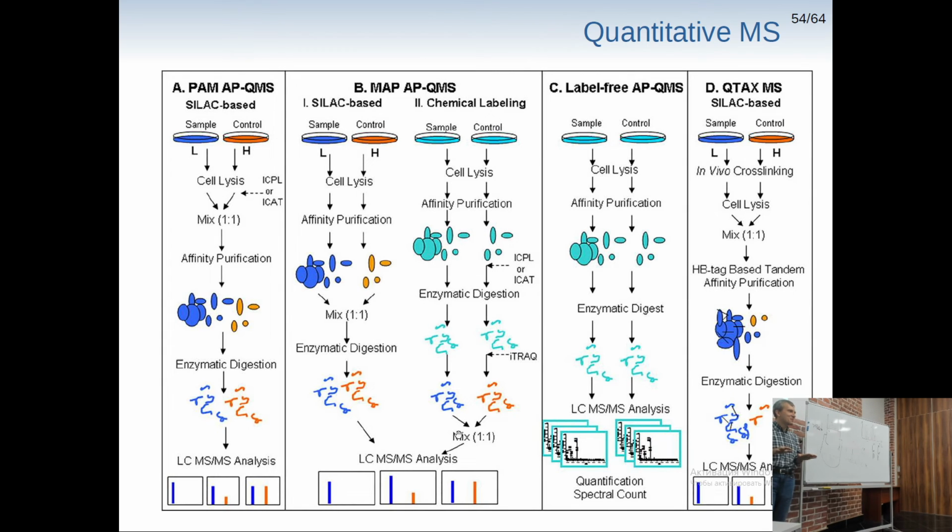So, just to sum up, we can't just compare two datasets from the same machine on different proteomes, even if it's the same name, the same solution, everything the same, even the same person doing it, because of some technical limitations, right? That's the bottom line. And to overcome those limitations, we have to have additional protocols which can label our proteins.